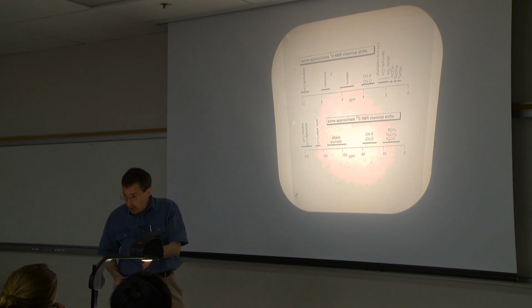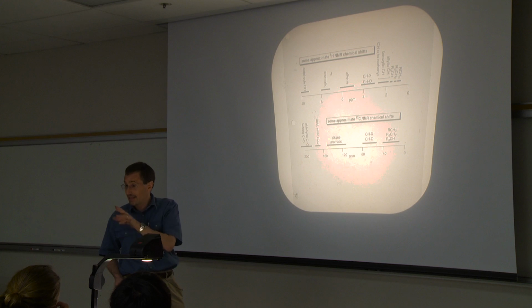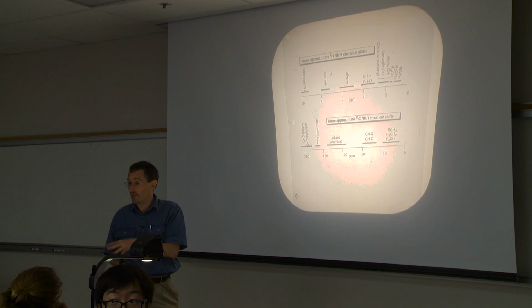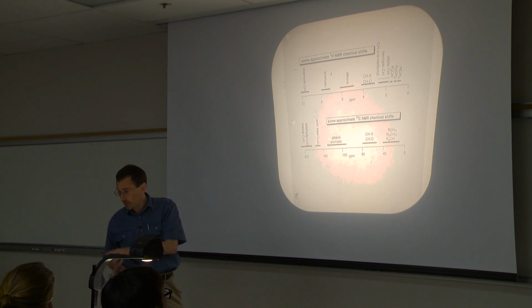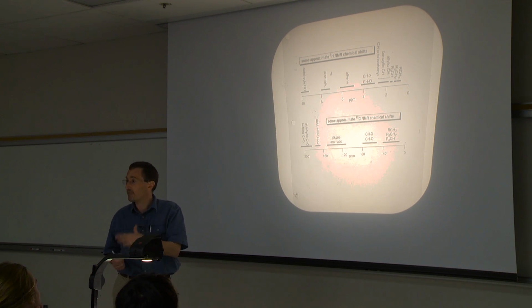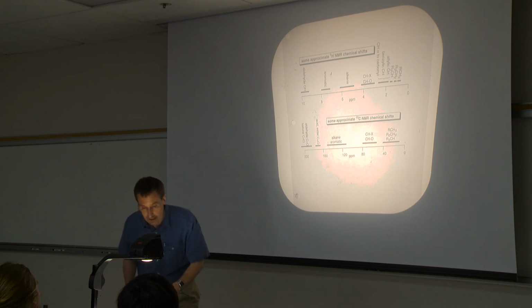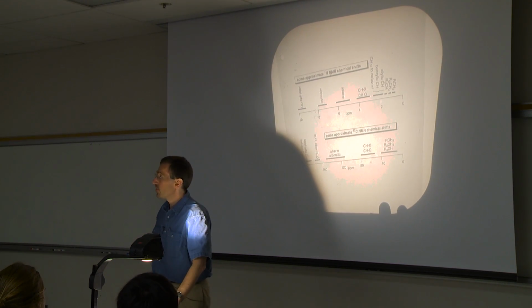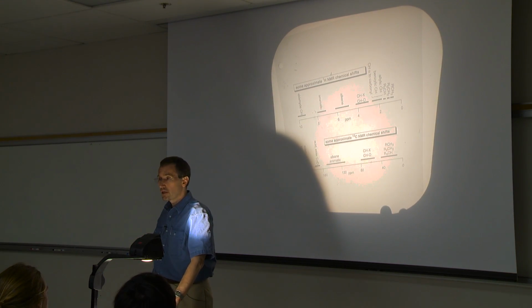I can show you examples of an alkene that is at 40 parts per million. So I can take things way out of there. But again, the norm would be, certainly as you're getting introduced, I love to teach from the rules and then the exceptions, and that's one way to think about it. So basically a starting point. It's a very good starting point. Other questions?